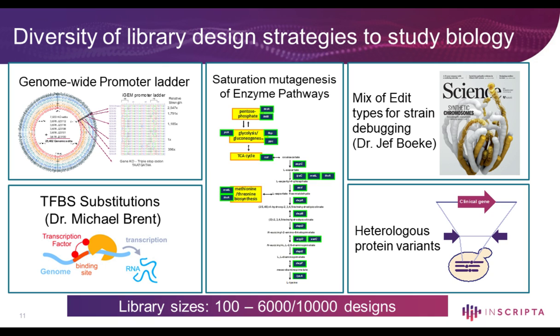Here, the example that I have is enzymes of the lysine biosynthesis pathway in E. coli, and we have done saturation mutagenesis of all the enzymes, and we also use transcription factors that regulate this particular pathway. So this gives you a handle on how to study pathway optimization.